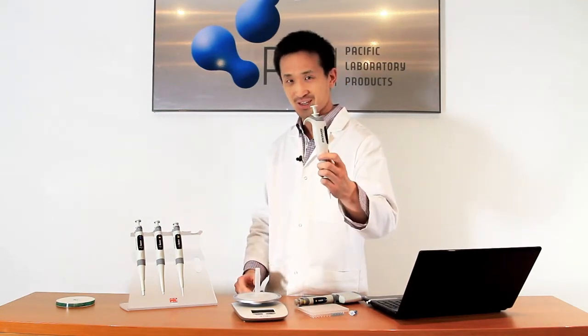That sums up this video on the HTL pipettes. Please let us know and we can see what we can do to try and get one of these into your hands for a trial. Thanks for tuning in. If you'd like any more information on this or any of our other great products, please check our website at www.pacificlab.com.au.